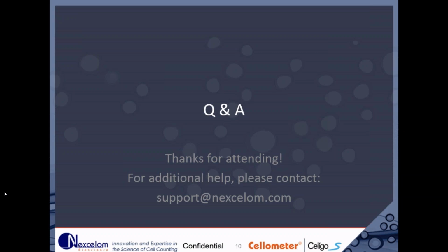It states, what if I want to test my antibodies against cells cultured and adhered to my test plate? Okay, so the surface antibody might be a little bit bigger and beyond the nuclei. Then you could probably use the application called Expression Analysis Merge. And if you want, we can do an online session together to go over some of the details on that one. So you would probably want to use a Hoechst staining to get at the nuclei, but then also have the second channel with your antibody with a merge.